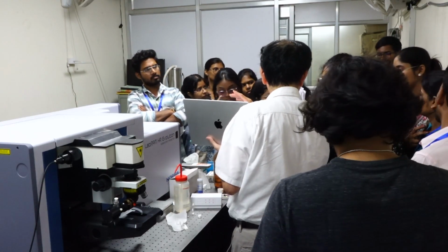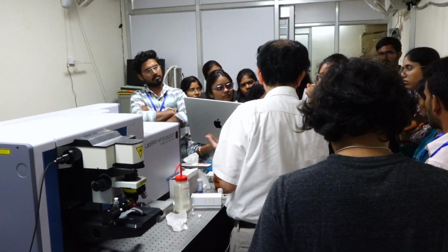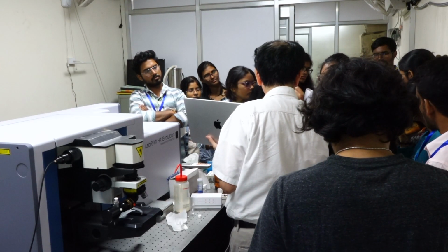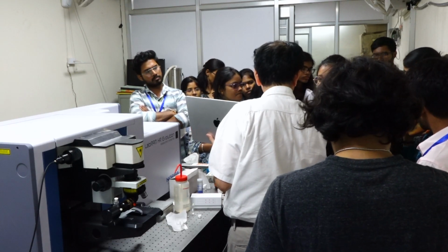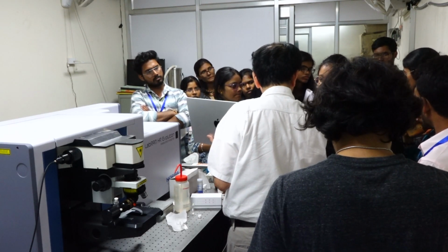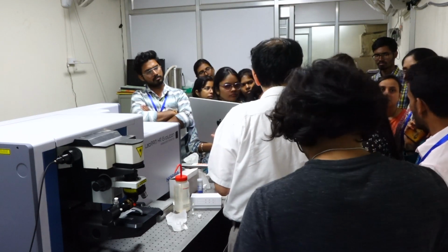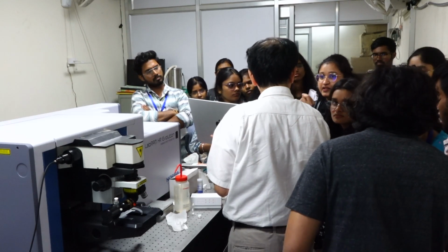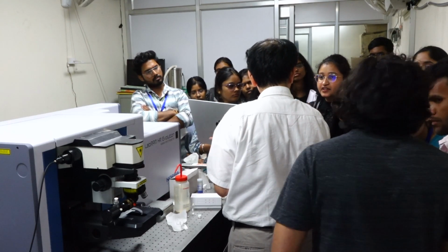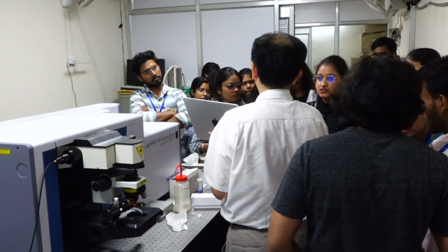Sir, if we increase the accumulation number, it means the number of times it is recording one spectrum will be increased. So it will be difficult to analyze that data. If we are seeing more peaks and the accumulation number is increasing, it will be difficult to interpret our result.